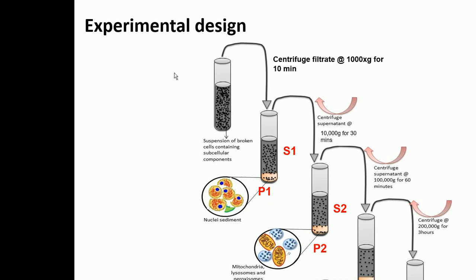The first one is your filtrate, basically. The homogenate you make, we call it a filtrate. Then you have 5 fractions: filtrate, P1, P2, S1, and S2. I'm going to discuss with you what you are going to do with all these fractions.